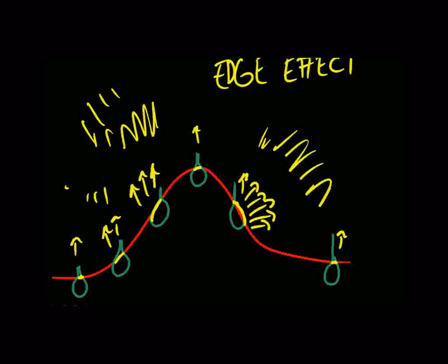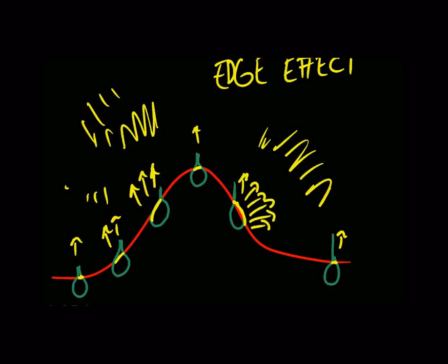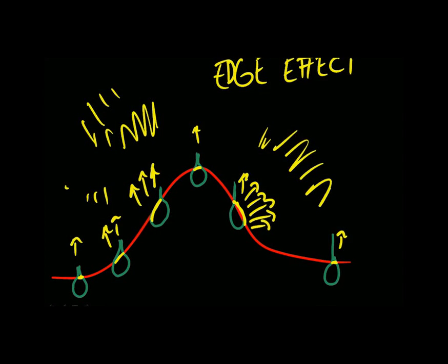Again, this tells us nothing about the composition. To gain compositional contrast, as you saw, we look at backscattered electrons. But for topographic contrast, secondary electrons are wonderful.